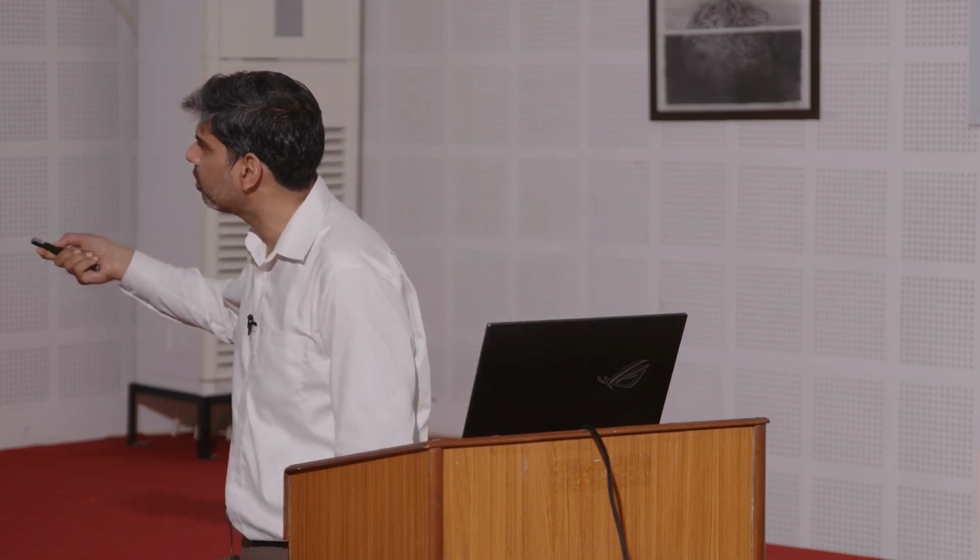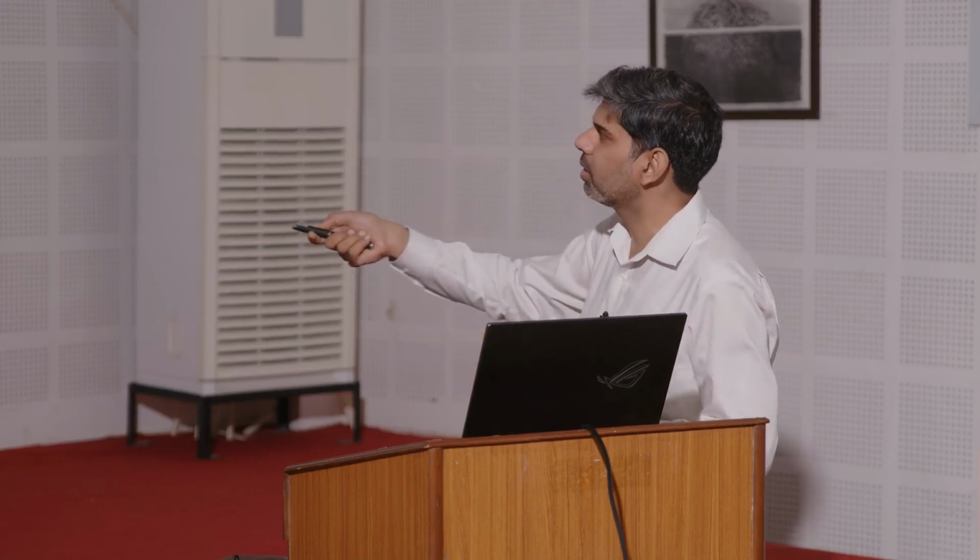So, the concentration will increase over time. Here I am showing this experiment. What you see is, look at this. Here the ions are moving towards the left, but electroosmotic flow is taking everything towards the right. You see that the initial concentration was low, but the concentration of the fluorescent species has increased over time, and the motion towards the right is due to the flow, not due to motion of ions. The ions are moving towards the left, electroosmotic flow is carrying towards the right.